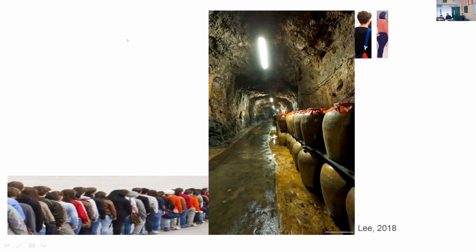So they will stay for some time. They will make a few tastings and then they will move out. And finally, there will be some people who are, I won't say addicts, but really lovers of alcohol. They would not like to leave the tunnel. They will stick. So the people here are what we call the mobile phase. Alcohol is the stationary phase.